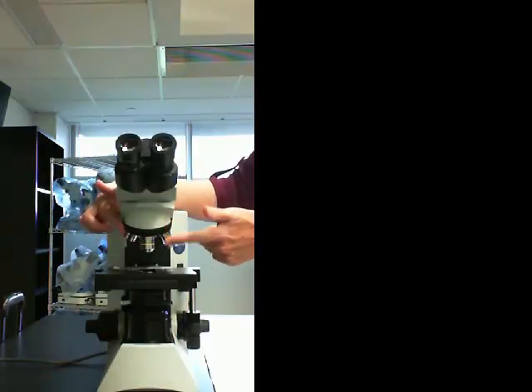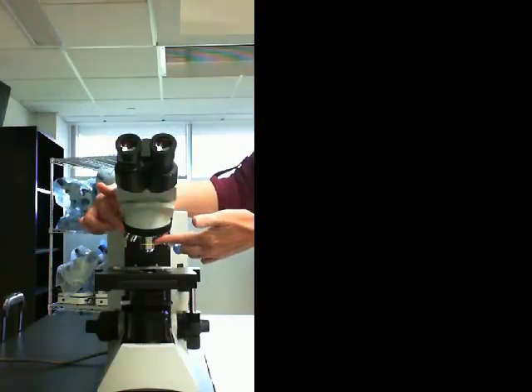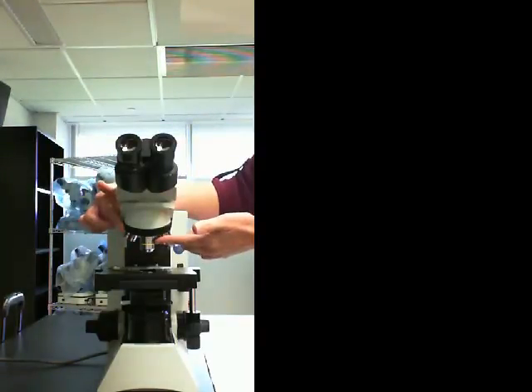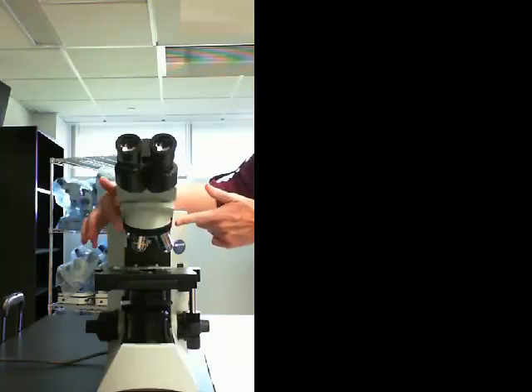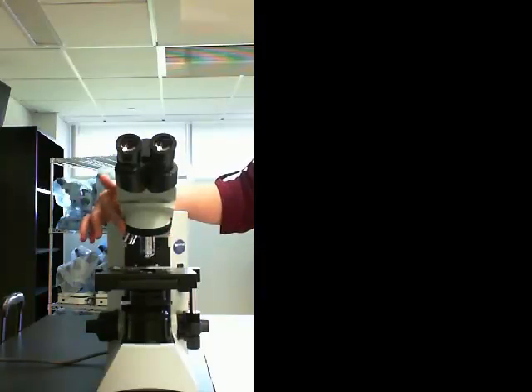You then move to your 10x or low power objective that you can tweak a little bit with the coarse adjustment knob and then further fine tune with your fine adjustment knob. This is again good for viewing a larger piece of your specimen. If you then want to hone in on a specific area, you would center that piece of your specimen and then move to the 40x objective or high power lens. You would then only use your fine adjustment knob for focus at that point. Other compound scopes then have a 4th objective, which is the oil immersion lens or 100x. Those are not currently on your scopes.